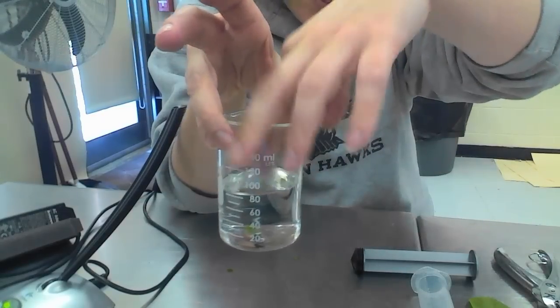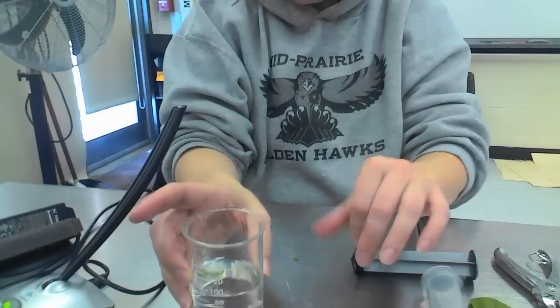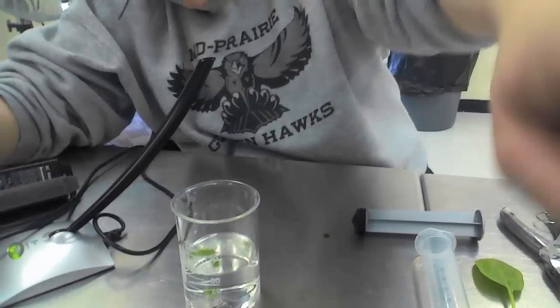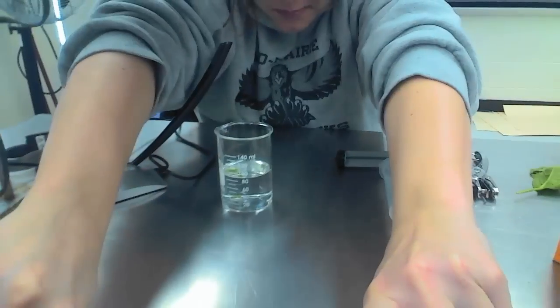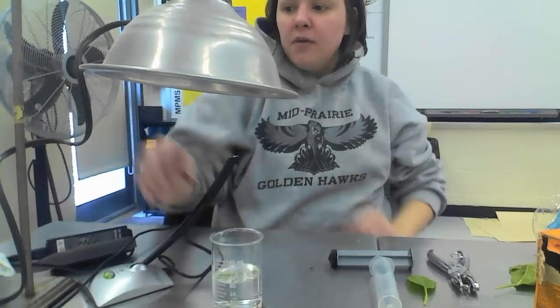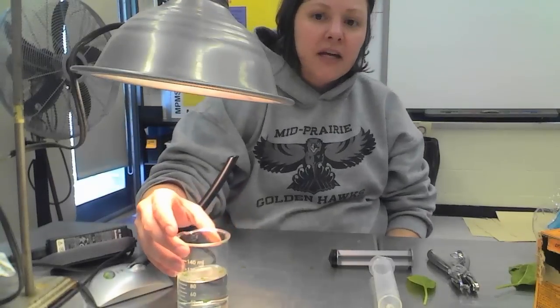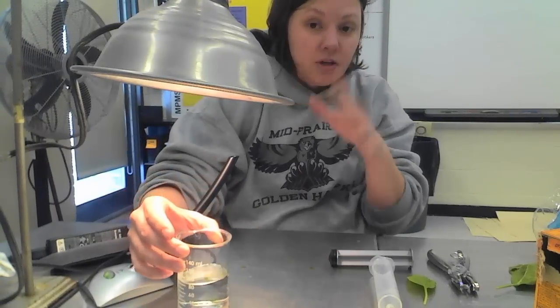Then we're going to put them in the light source. That one I didn't get all out. So we're going to put it into the light source. Now you're going to have this light source, and I don't know if y'all can see very well, so I'm going to push the camera back a bit. So I have my light source right here. But the problem is if I turn this on and put this over here, it's going to create a lot of heat for this plant, and that's something we don't want.